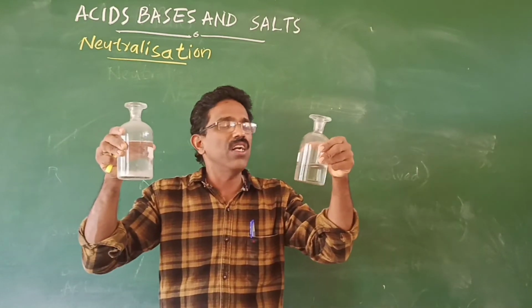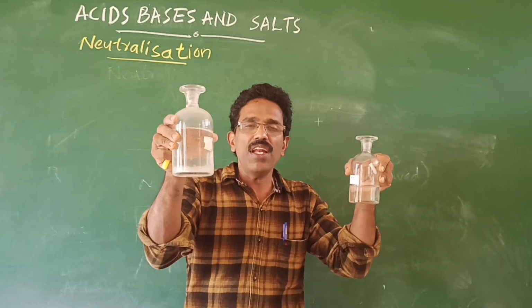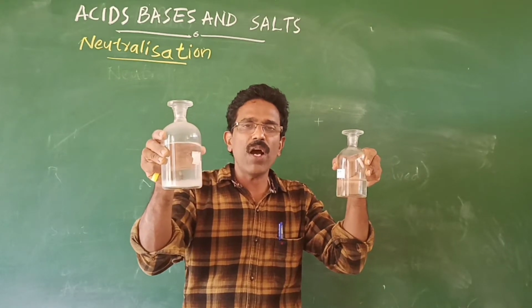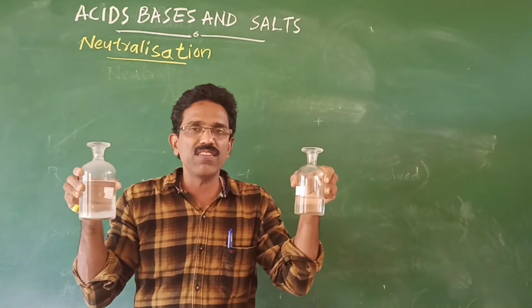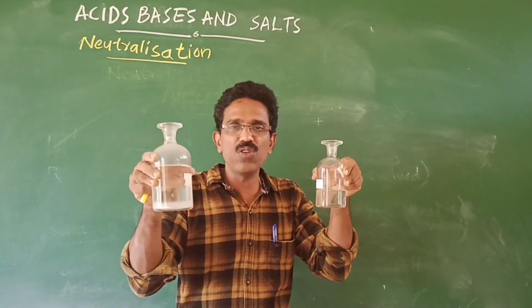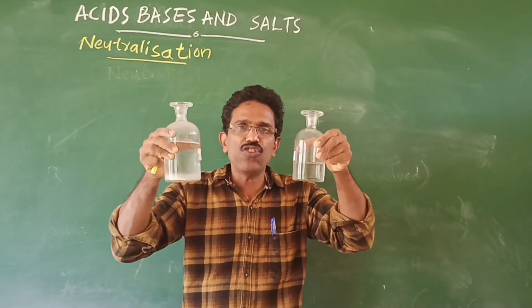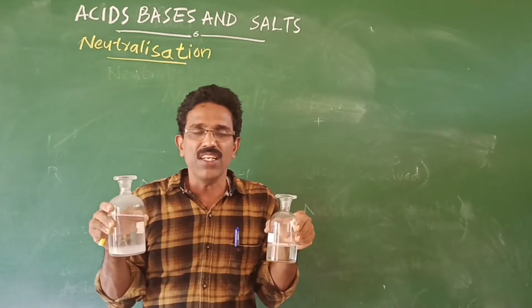We have taken dilute hydrochloric acid, dilute HCl, and dilute NaOH, that is sodium hydroxide. What happens when these two mix together?